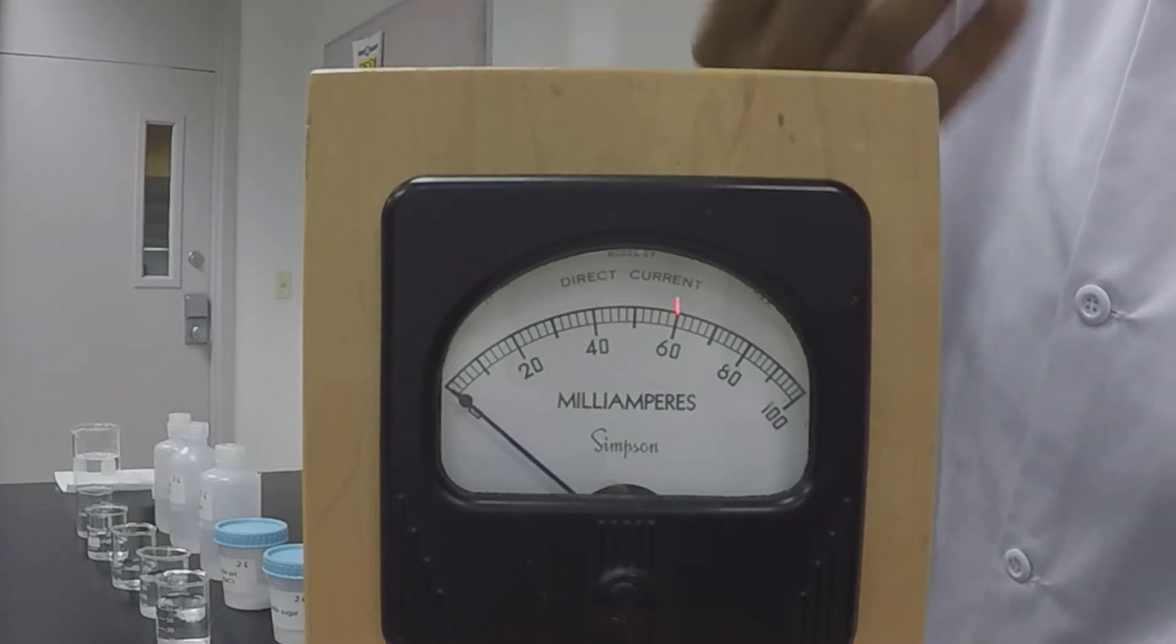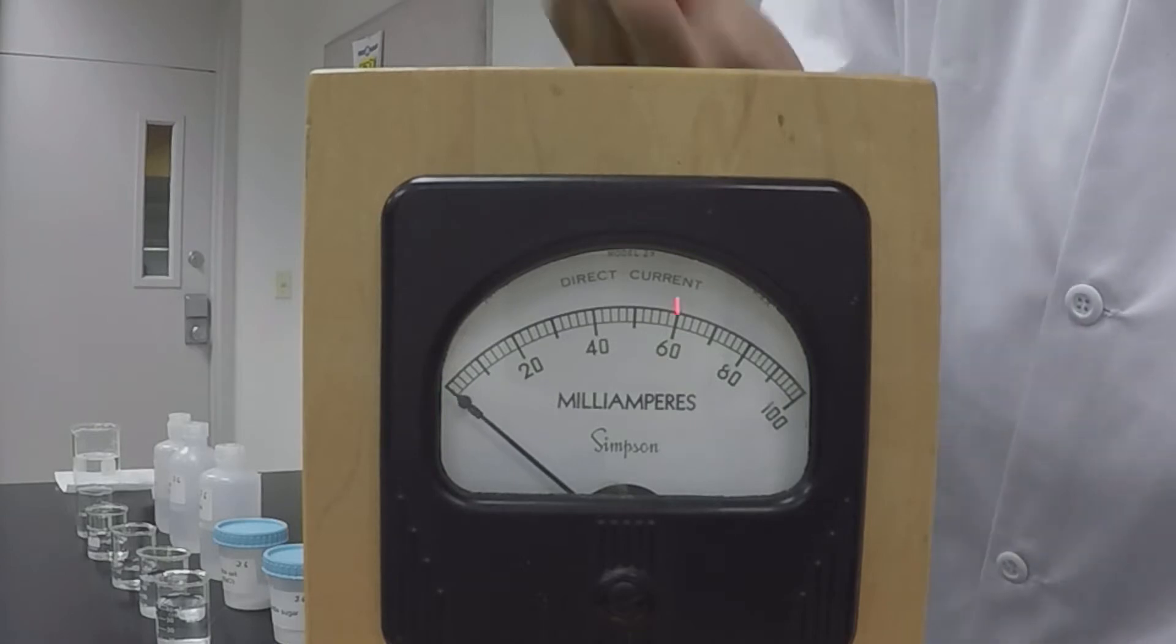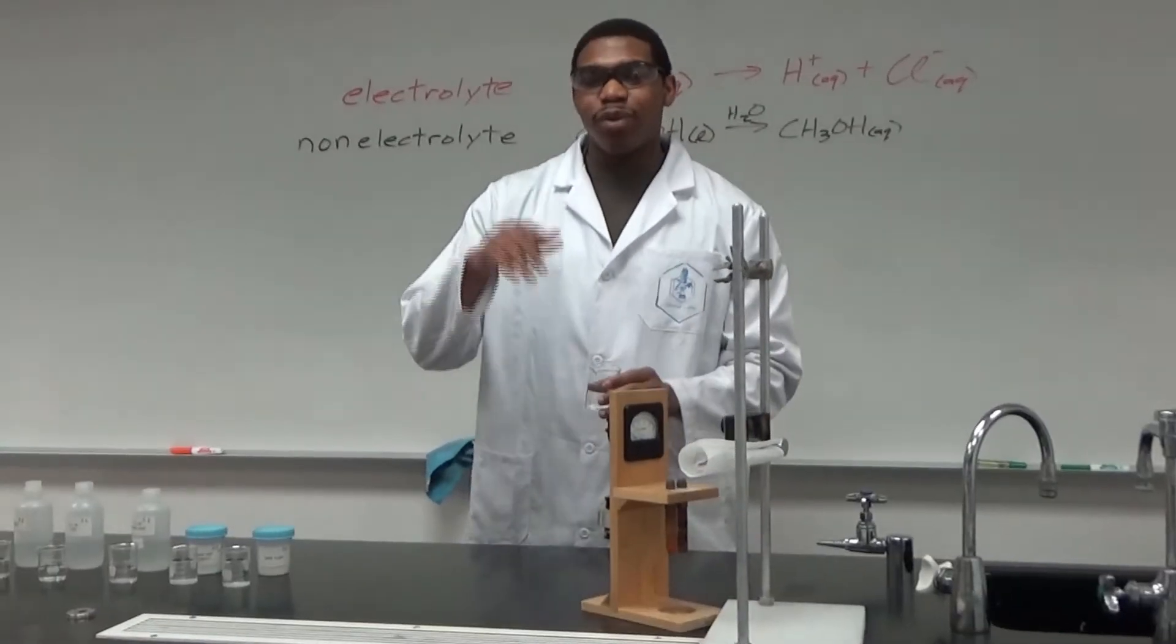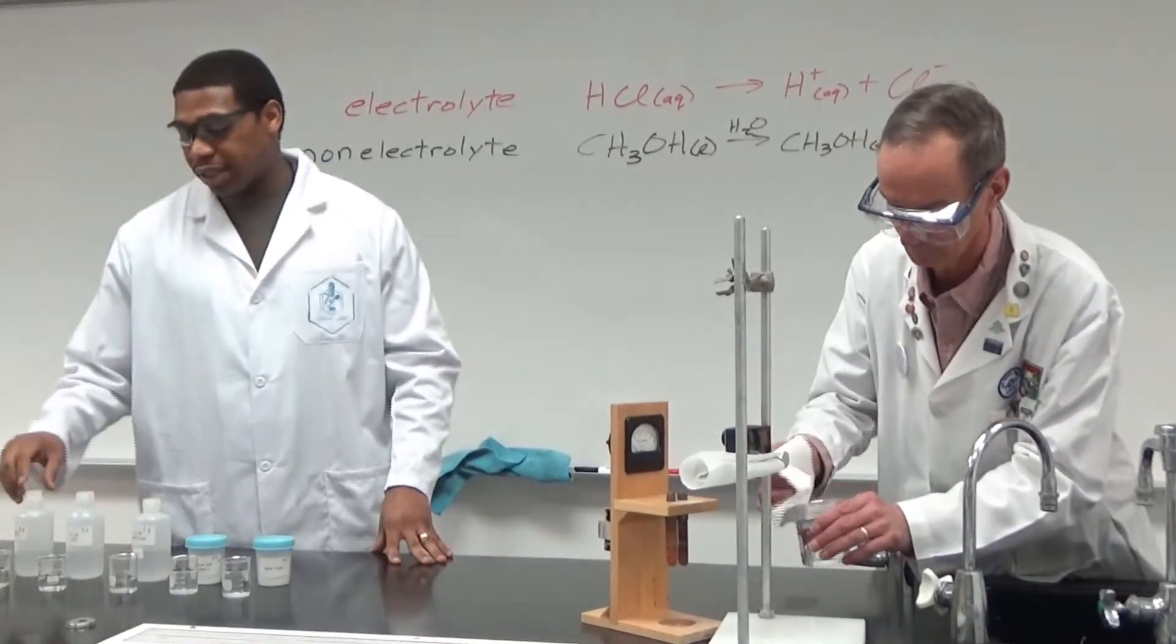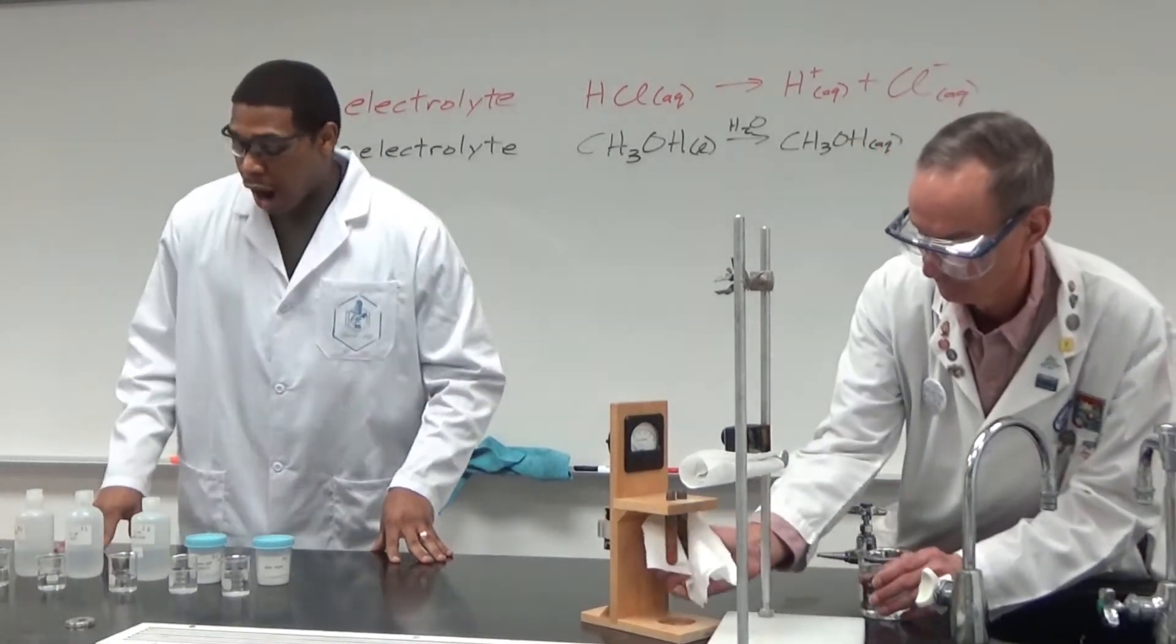You should hopefully see the arrow in this meter start to spike up a little bit. So not really conductive, but more than DI water, which is completely a non-conductive material.